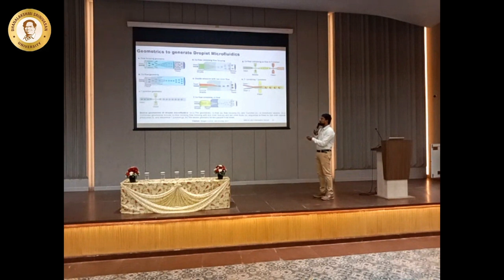Say here we have two different colors. You say I want to make some iron oxide over a gold. I can do it. So red is gold and green is iron oxide, iron chloride. So I can create Janus particles. So anything is possible. Depending on your requirement, that's what I said.